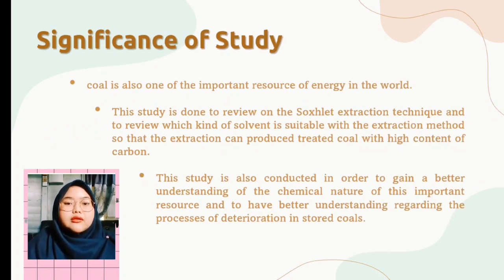Significance of study. The first significance of this study is because coal is also one of the important resources of energy in the world. Therefore, the production of high quality coal is important. Secondly, this study is done to review the Soxhlet extraction technique and to review which kind of solvent is suitable with the extraction method so that the extraction can produce treated coal with high content of carbon. Thirdly, this study is also conducted in order to gain a better understanding of the chemical nature of this important resource and to have better understanding regarding the processes of deterioration in stored coals.